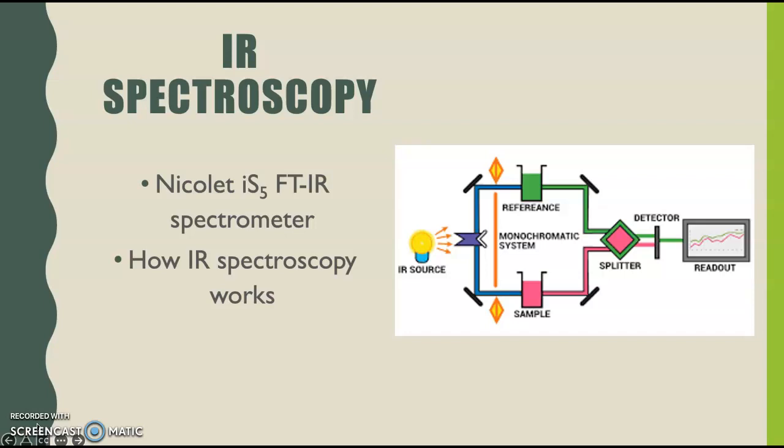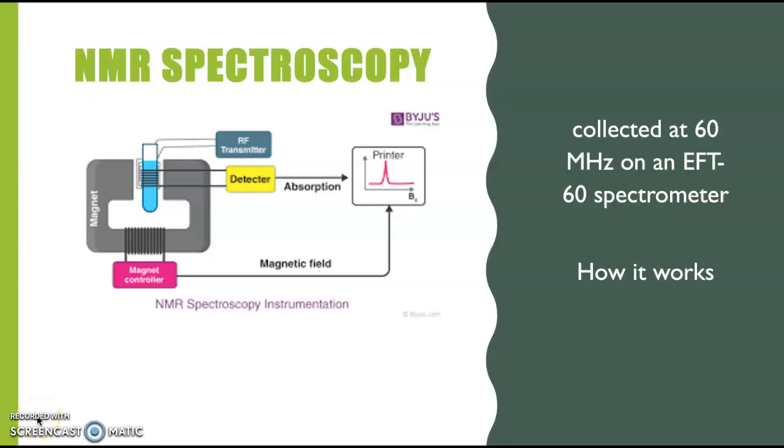The spikes on an IR map show that a functional group is absorbing the infrared light and causing the percent transmitted to be lower. There's also a fingerprint region on the scan that causes indecisiveness on what is the exact functional group. What is NMR spectroscopy?